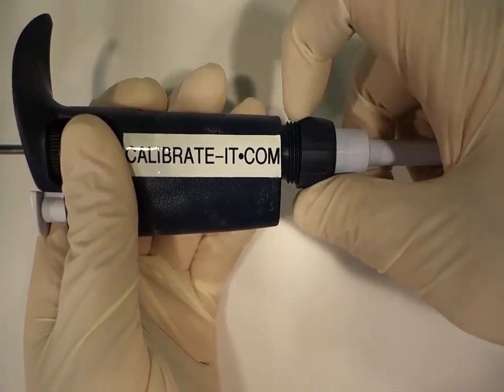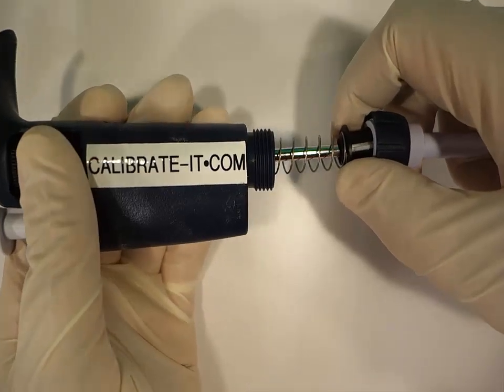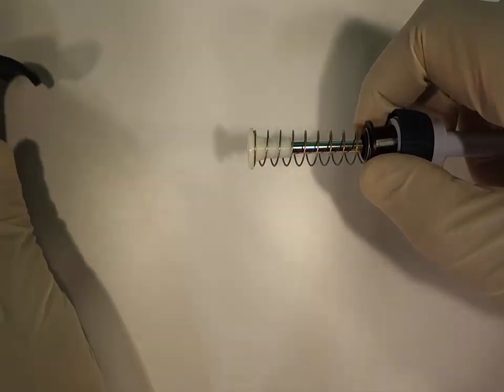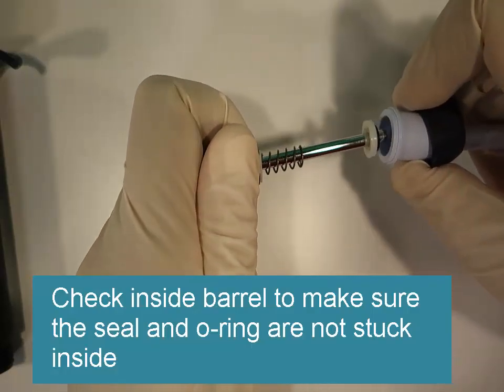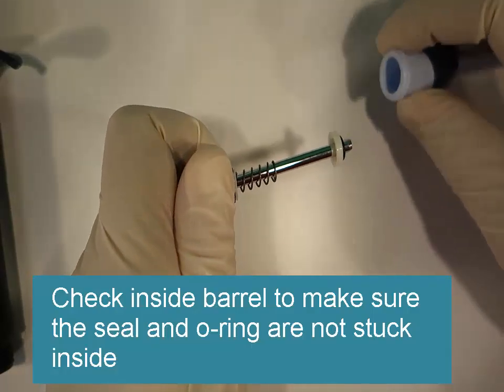Remove the barrel by unscrewing the collar like this. Carefully remove the piston assembly, making sure all the parts are removed together. Lay the piston assembly aside to clean later. Rinse the barrel out with tap water and wipe the outside with a lab wipe.